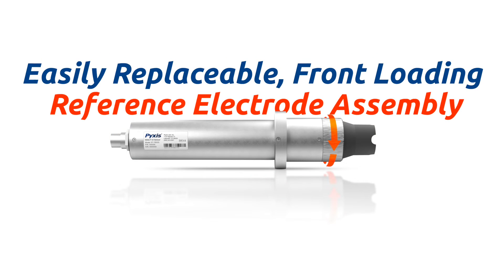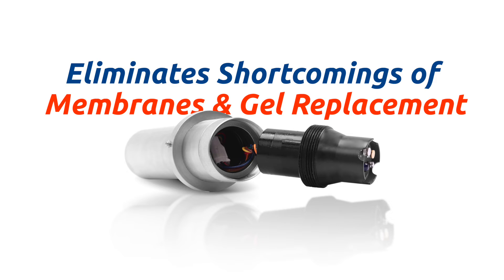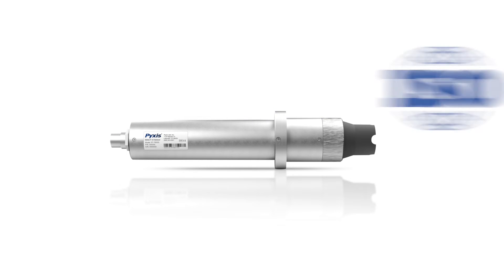The ST765 sensors offer an easily replaceable front-loading reference electrode assembly, eliminating the shortcomings associated with membranes and gel replacement, while offering reduced polarization time during sensor startup and providing instantaneous residual detection. This highly accurate platform is consistent with DPD wet chemistry methodology at pH as high as 9.0 and meets EPA 334.0 and ISO 7393 compliance.